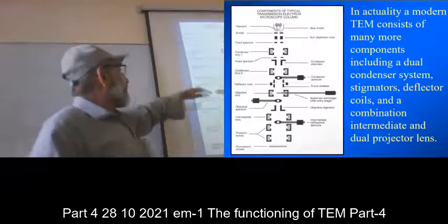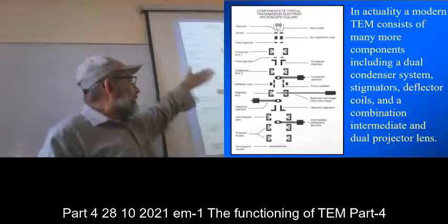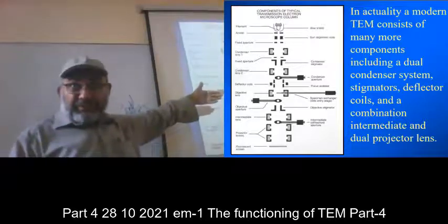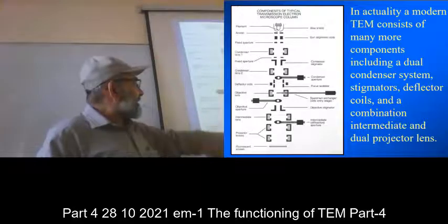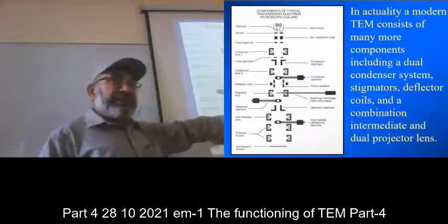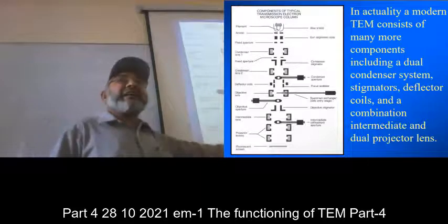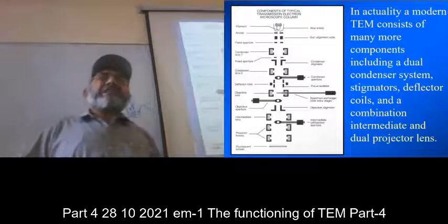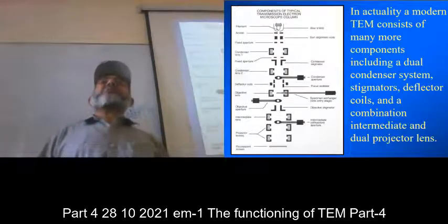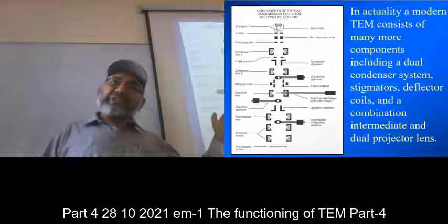When you come from there, then you come to the objective lens, then objective aperture, then objective stigmator, and then intermediate lens, intermediate diffraction aperture, and projector lens, and this screen. These apertures are playing the most important role after the lenses in the machine.